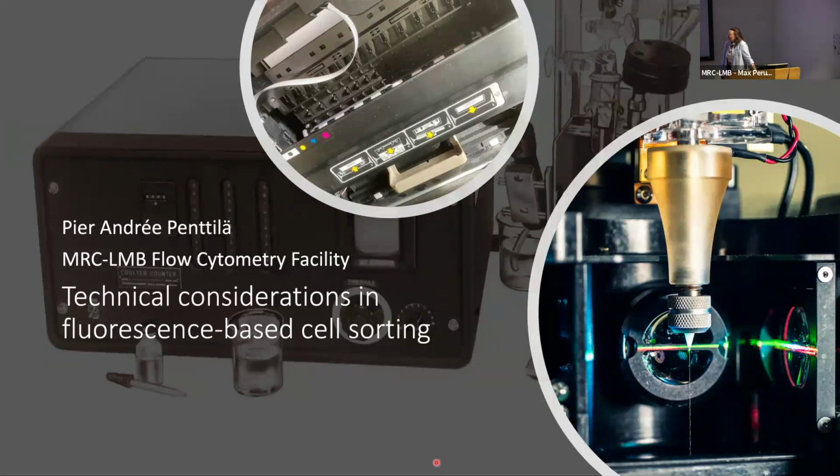My name is Pier Andrée. I'm the head of the LMB Flow Cytometry Facility, and today I'm going to talk to you a little bit about some of the things that we set up, the technical considerations in cell sorting specifically. Fan this week discussed flow cytometry on a general level, the analysis, how it generally works. I'll dive in a little bit more into cell sorting specifically, which takes flow into a whole other level.